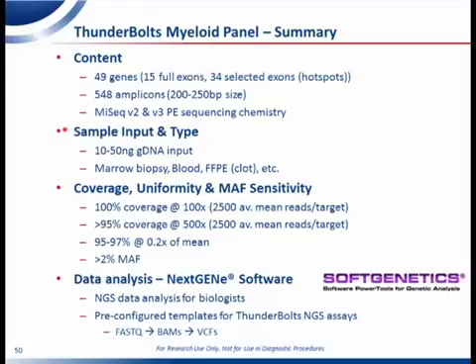The next question is for Jeff. What is RainDance recommending for sample indexing on a single flow cell of the MiSeq? We're recommending 8 samples if you have a version 2 kit for the MiSeq, and 16 samples for the version 3 kit. Okay. Thanks, Jeff.